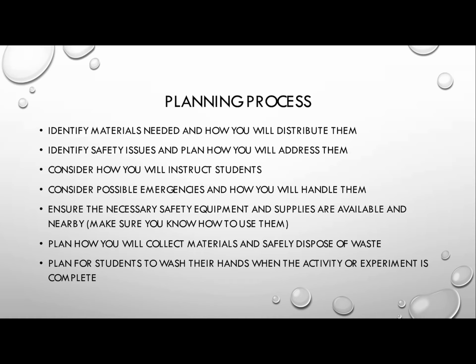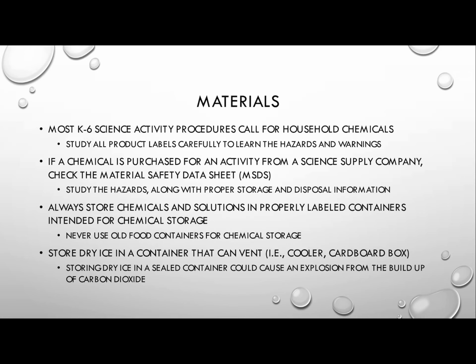Plan for students to wash their hands when the activity or experiment is complete. So the last part is kind of the important wrapping it up. How will you make sure that the students have washed their hands? So let's kind of go through this step-by-step process.